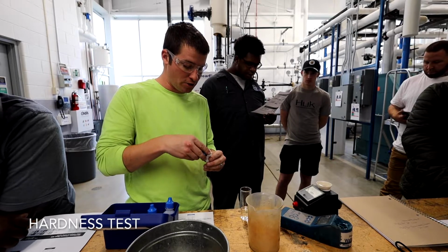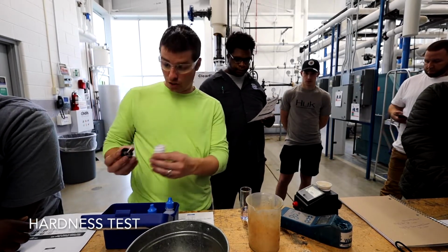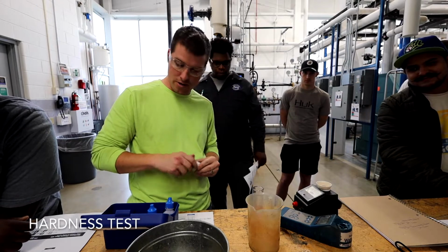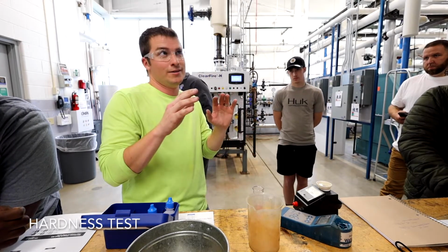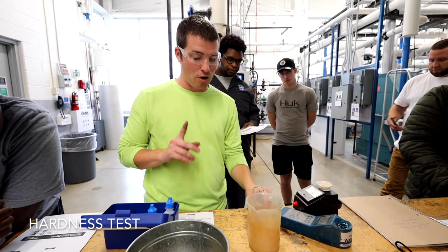And how much hardness do we want in our feed water tank? None, right? Oh, look at that. Purple, red. Pink. So, we got some hardness. All right? We will test the softener again too and make sure. It could be working. We'll go through that when we get there. What could be wrong if it's not working?